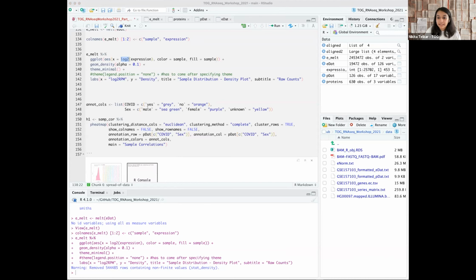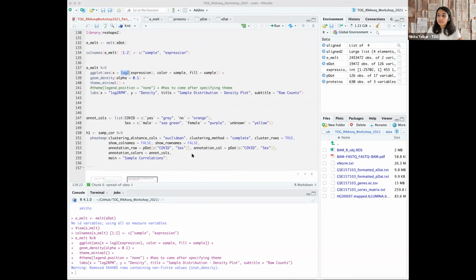What that means is basically that all of our 0 counts will have a count of 1 additionally added to that. It's not just the 0, all of them. So we're just shifting all of the counts by 1 in order to plot our data. It's not changing the spread of the data.